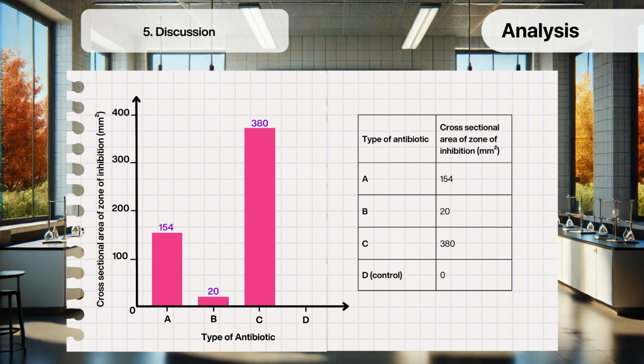In your discussion, you should also identify any unexpected results or anomalies. Consider reasons for these, such as potential contamination, uneven bacterial distribution, or variability in the concentration of the soaked discs. This structured approach will help you precisely understand how different antibiotics and disinfectants affect bacterial growth, and make informed conclusions about their effectiveness.